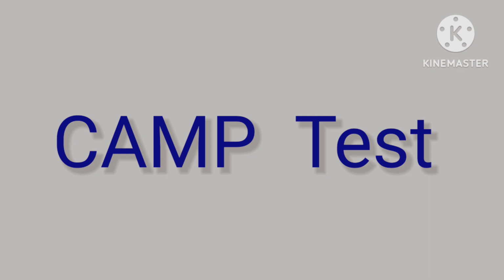Hi everybody, let me tell you in detail about the CAMP test. C-A-M-P, CAMP test. CAMP stands for the name of three scientists who described it in 1944. That is Christie, Atkins and Munch-Peterson. This test was developed initially for the detection of group B streptococci that were responsible for producing mastitis in cattle.